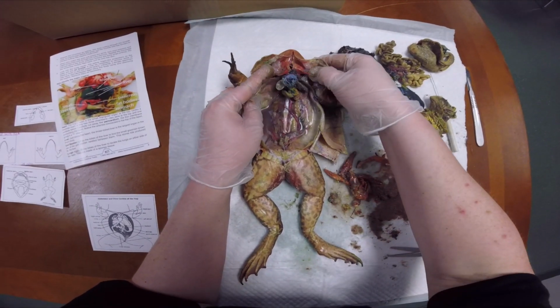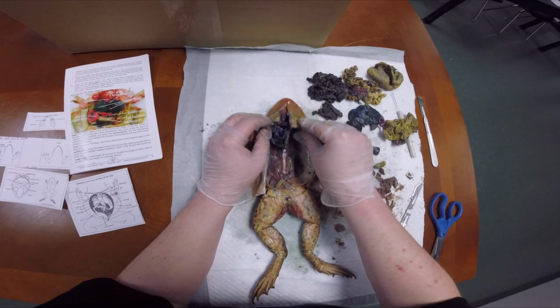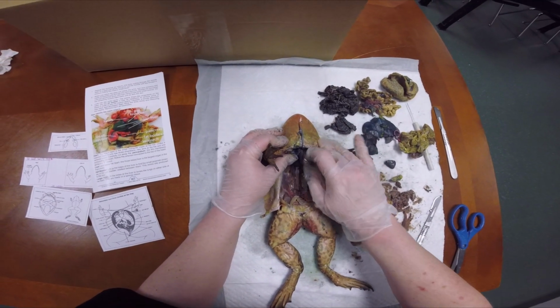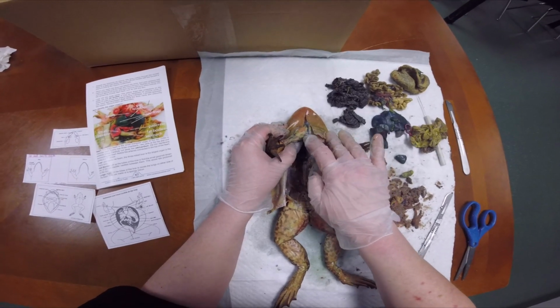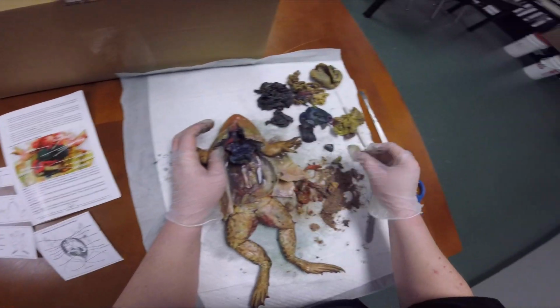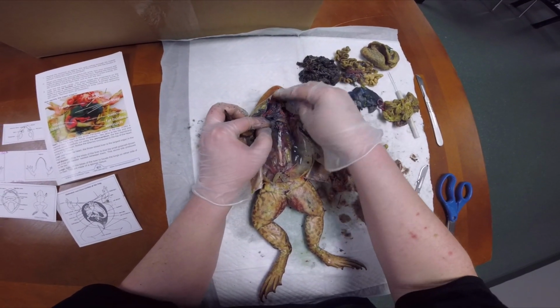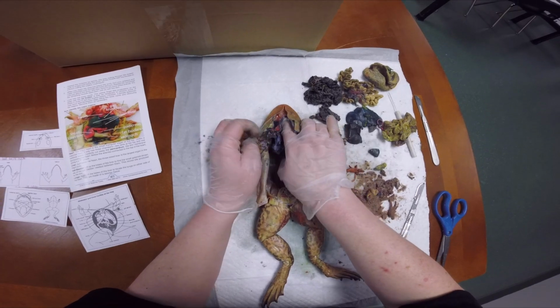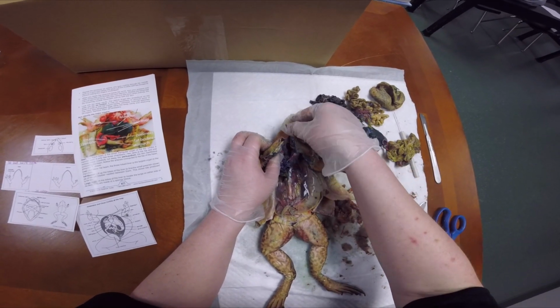Okay. So now let's get up here. The heart is usually right underneath this incision. So when you make this incision and you go down, the heart is right there. So this little blue guy is our heart. Okay, so then we just have guts and stuff up here. You can feel the mouth. You can go in through the mouth in here.